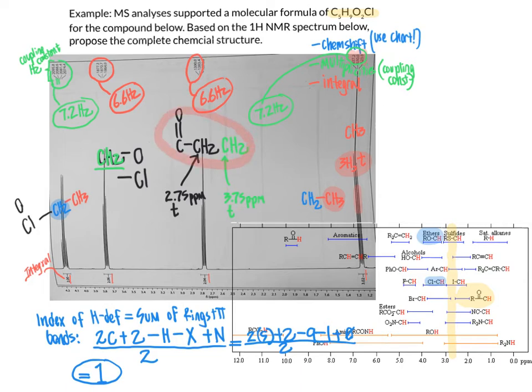And so that gives me further evidence suggesting that we are on the right track with this piece of the structure. So we had previously pieced together this carbonyl bonded to two CH2 groups. We had also pieced together this ethyl group here as well, CH2, CH3, and that would actually encompass all of the proton signals here, because looking at the 4 proton signals, we've accounted for 4 types of protons: our methyl group, CH2 methylene in blue, CH2 methylene in green, CH2 methylene in black, and then our carbonyl. So now we need to figure out how to stitch this structure together and incorporate the necessary atoms based on these substructures, based on these parts and pieces that we have.